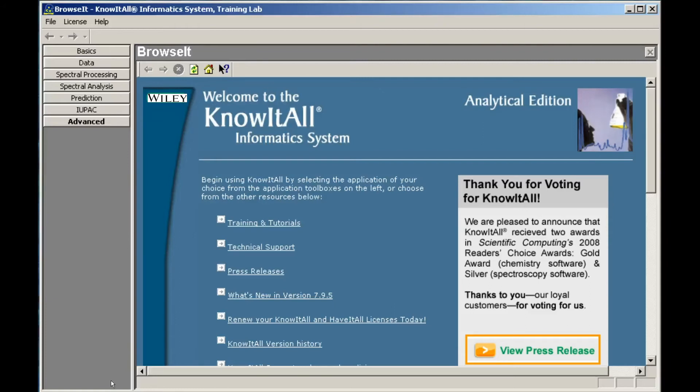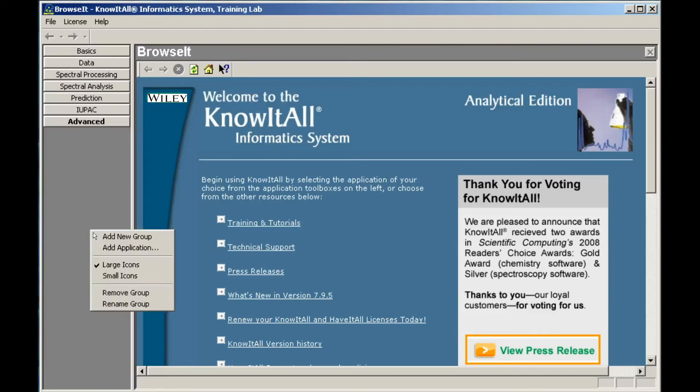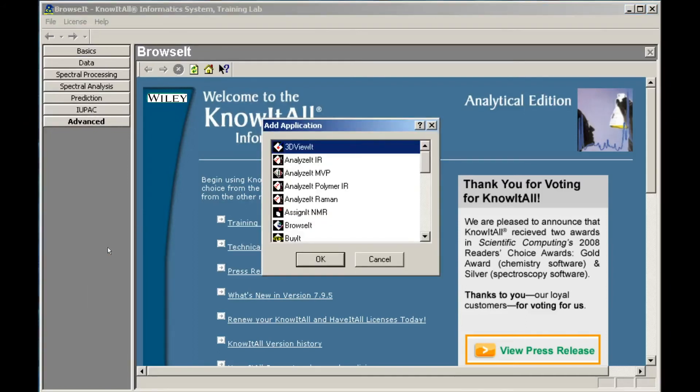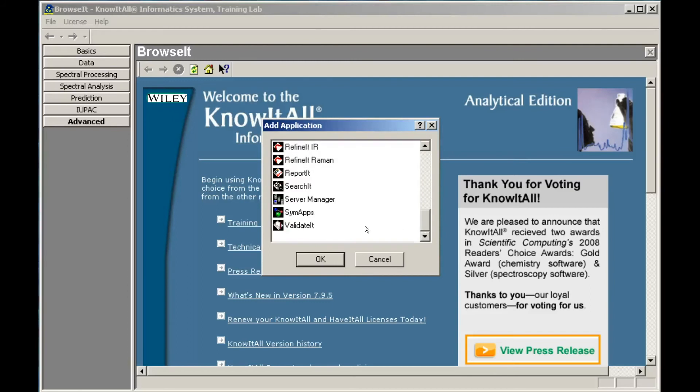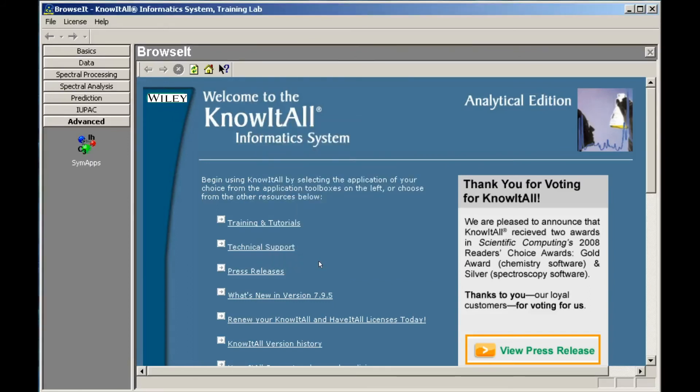To add applications to the new toolbox, right-click to open the pop-up menu, and choose Add Application. Select the application you wish to add, then click OK. The application has been added to the new toolbox.